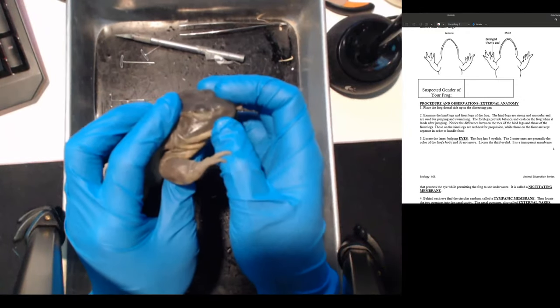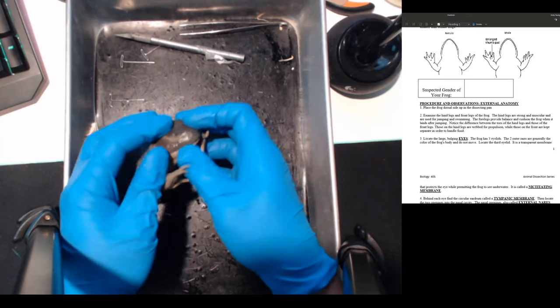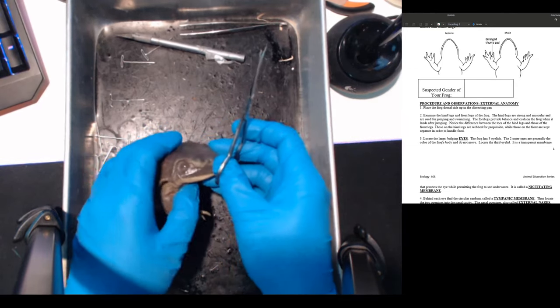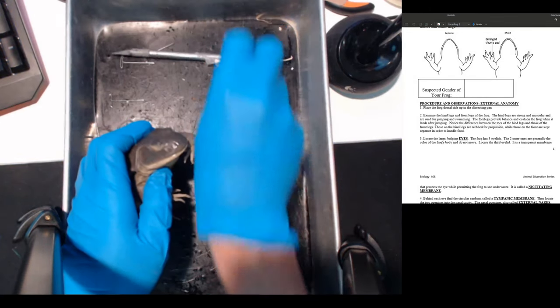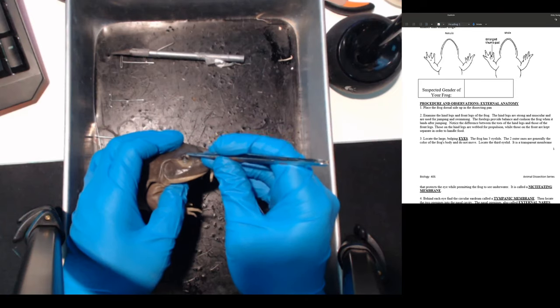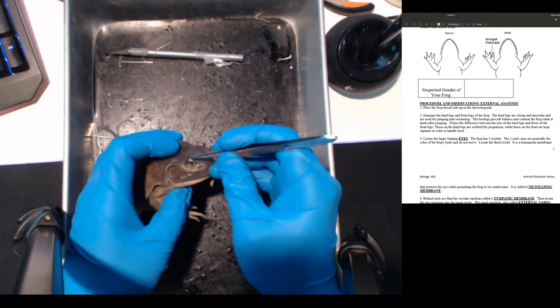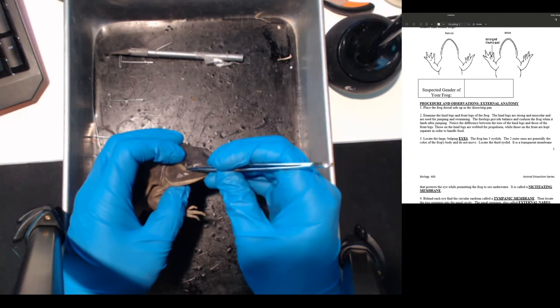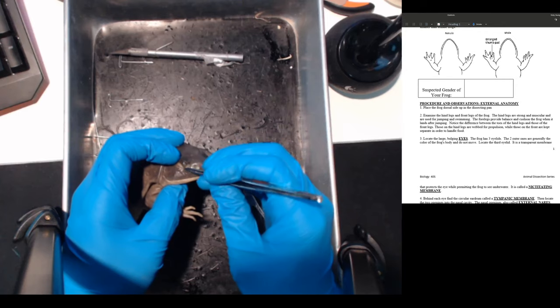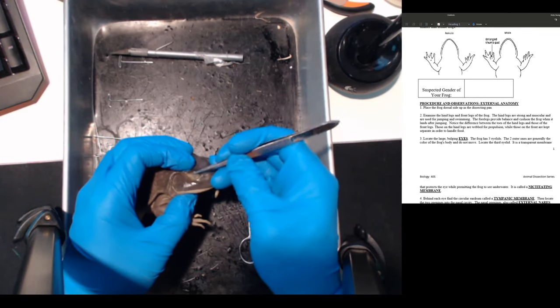Locate the large bulging eyes - frogs have three eyelids. Let me see if I can bring this into focus. We can start cutting open and see that there are actually three eyelids here. This is one of the eyelids right here that can open and close. Here's another eyelid, and there's your eyeball. The nictitating membrane is going to be one of these membranes that's transparent.